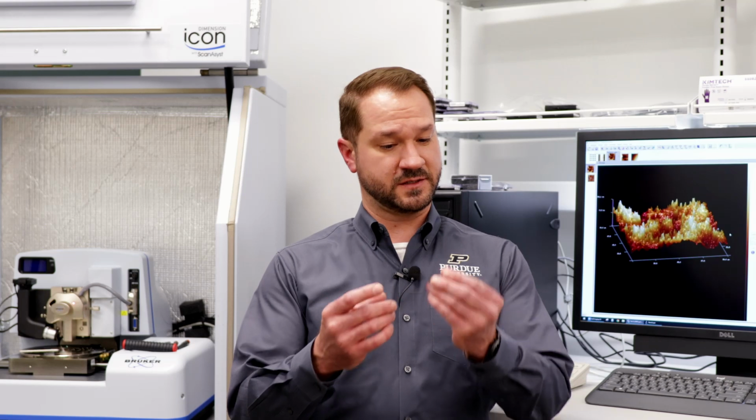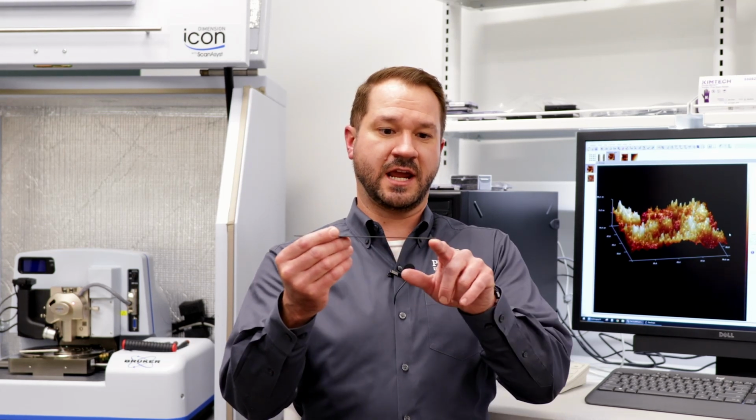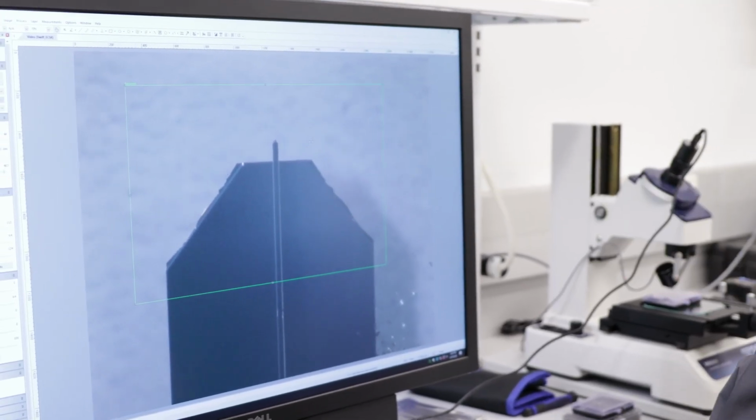microchip manufacturing. If you're working to characterize an object on the nano level and you cannot see what the object is, we have to sense the surface. So the way that this operates is, and this is a large version of the cantilever that's used in the device, we have a cantilevered arm with a small probe at the end of the cantilever. Theoretically, at the top of that probe is one atom.